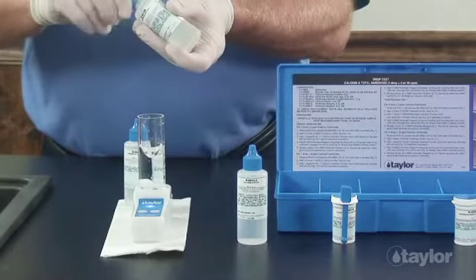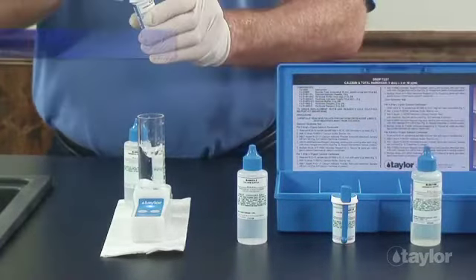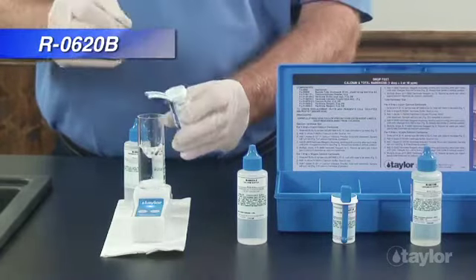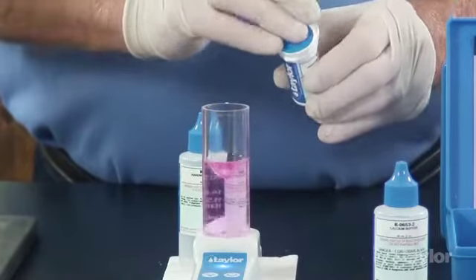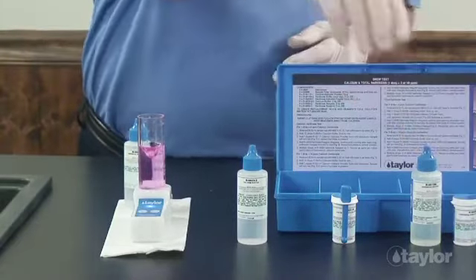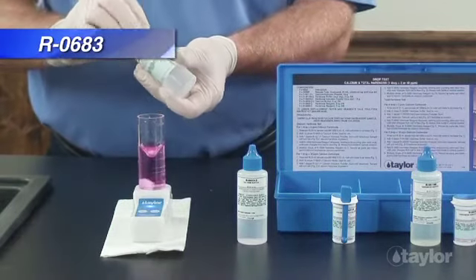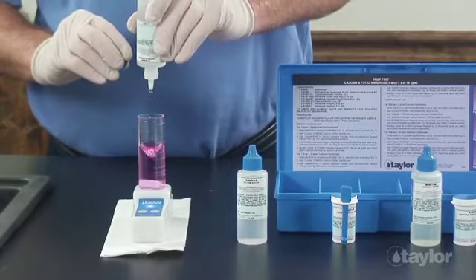Swirl to mix. If hardness is present, the sample will turn red. Add hardness reagent dropwise, swirling and counting after each drop until the color changes from red to blue.